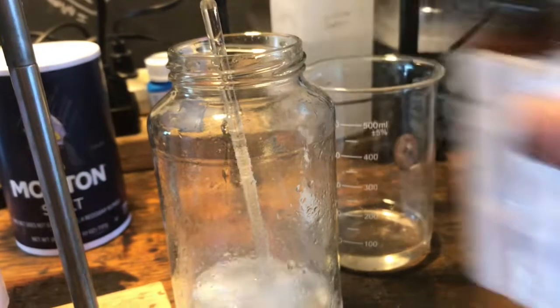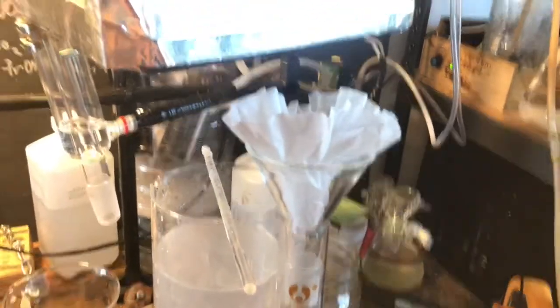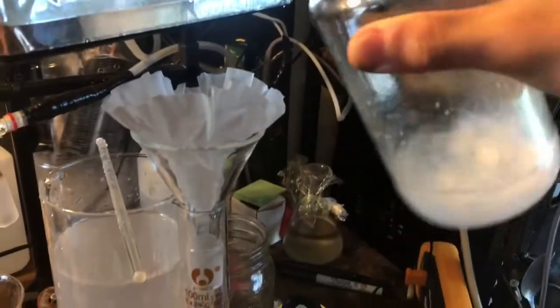Now you're left with the crude xylenes, which you can dry using a drying agent such as magnesium sulfate. You can also use calcium chloride, however calcium chloride is bad for this.